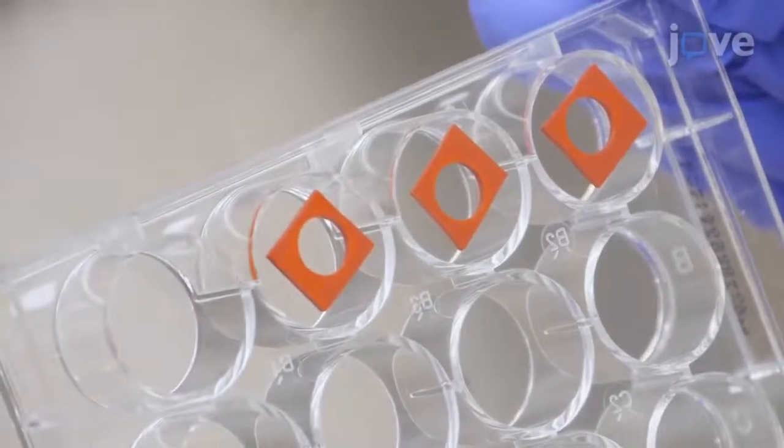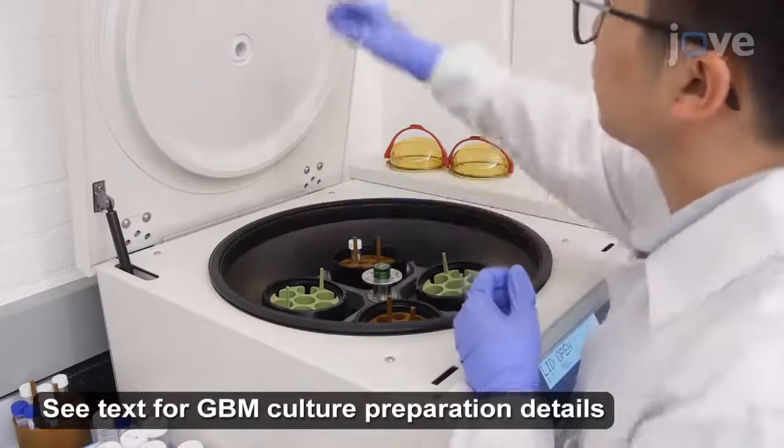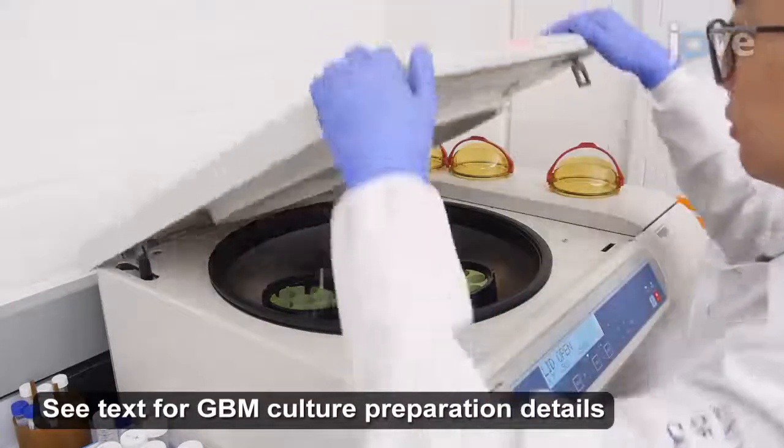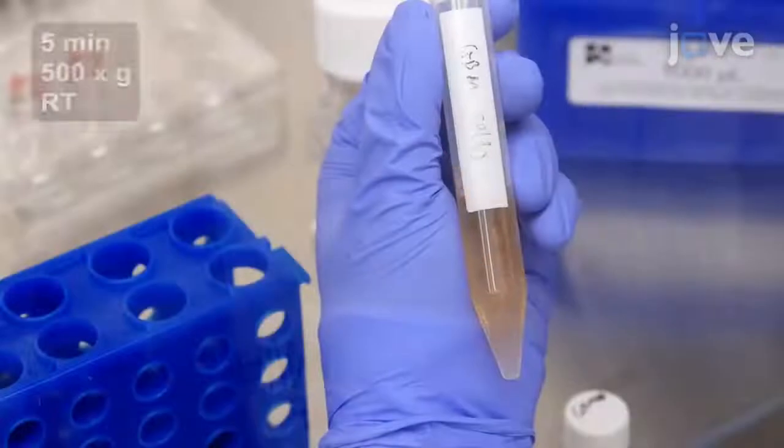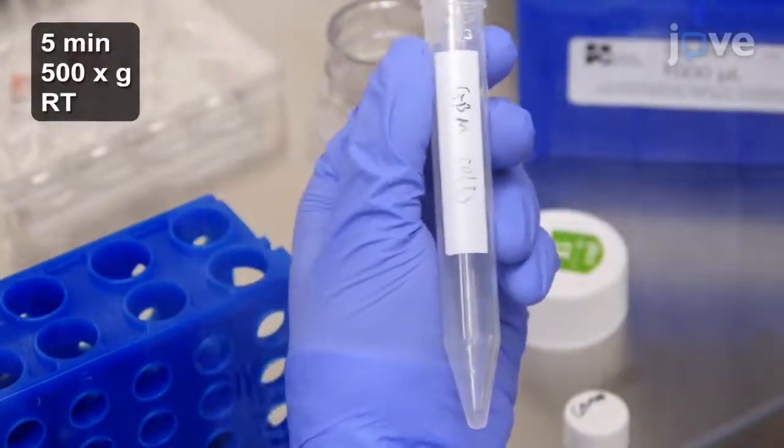After checking the seal between the molds and the well bottoms, collect the dissociated gliomaspheres from a glioblastoma cell culture by centrifugation and re-suspend the pellet in 1 milliliter of cell dissociation enzyme.